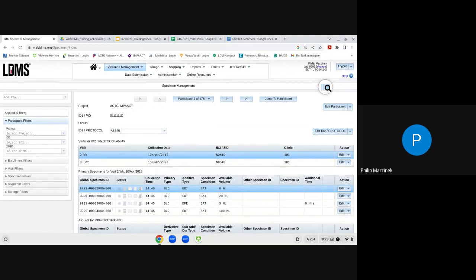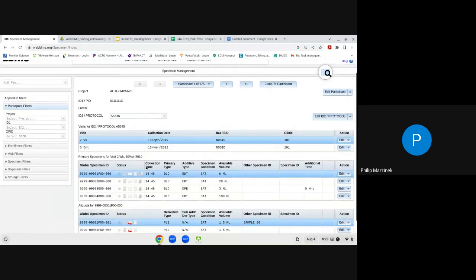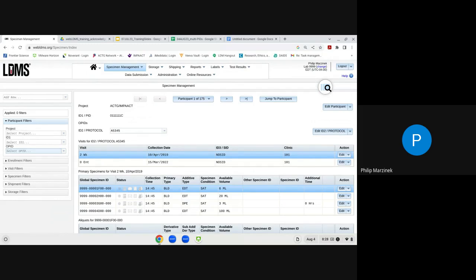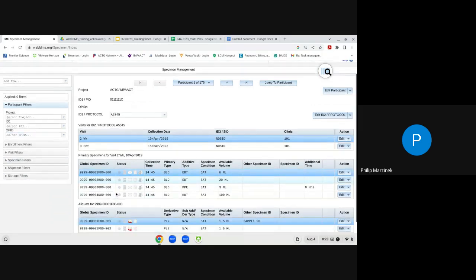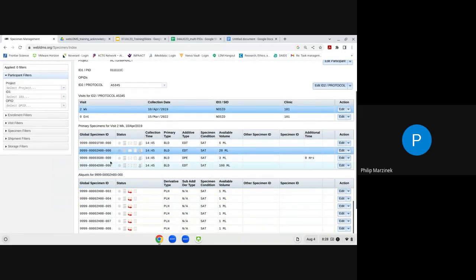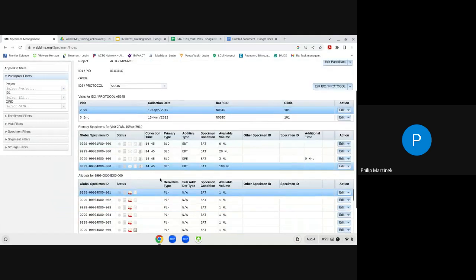The next level of dynamic functionality is the Visit Grid, which shows the visit value and units, collection date, ID3 sub-protocol ID, and clinic value. Toggling between visits updates the primary and aliquot grids to show specimens related to the selected visit. The last level of dynamic functionality is the Primary Grid — toggling between primaries updates the aliquot grid to show only those aliquots specific to the selected primary.